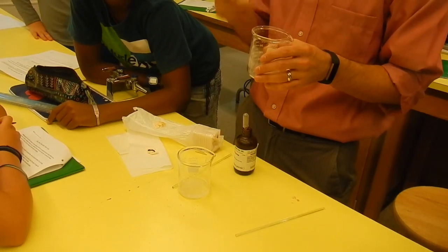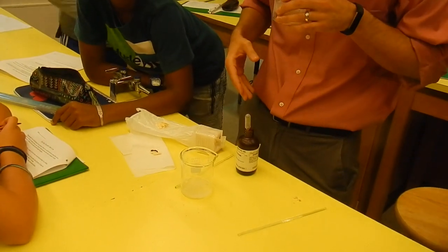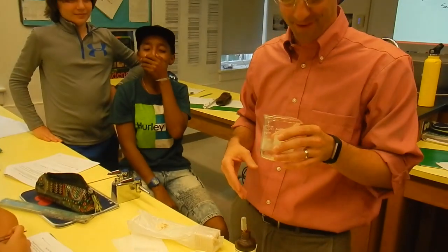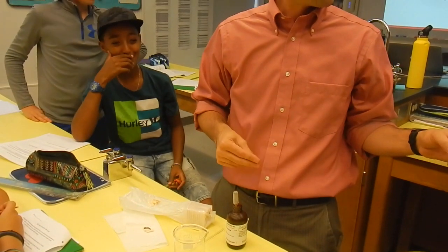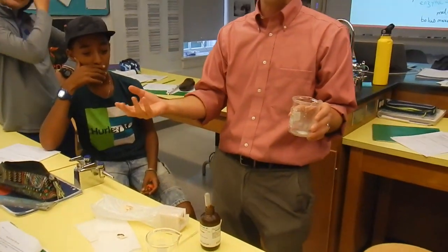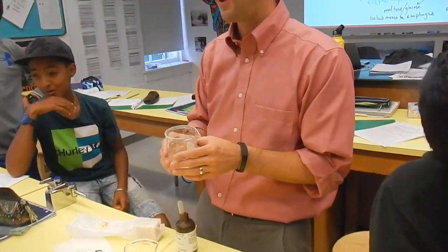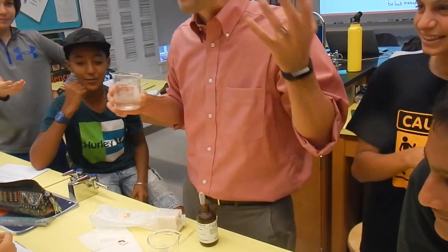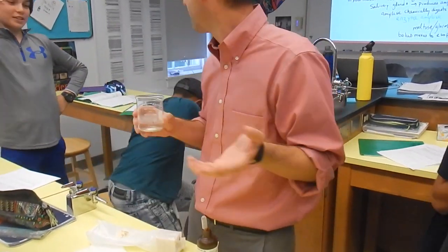No loogies. Did you hear that? No loogies. Drop it carefully. That's disgusting. Next. In order for this to work, I need all of your amylase. This is like your blood donations, okay? Please do not spray all over.